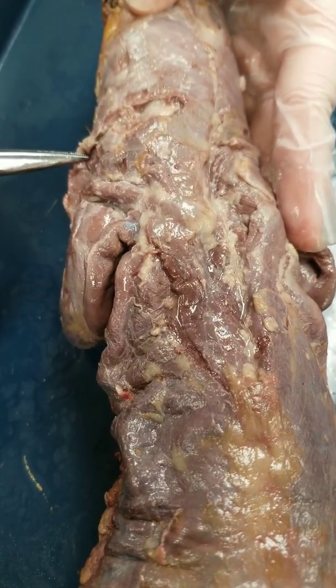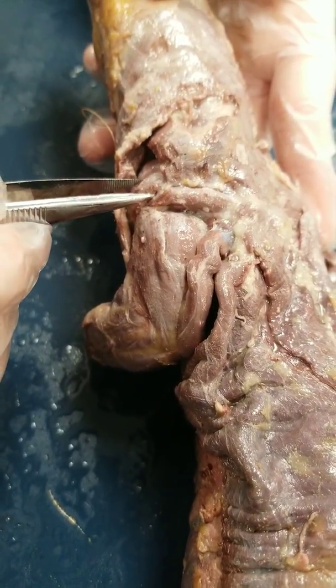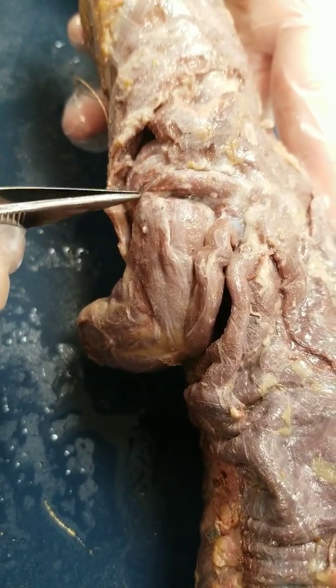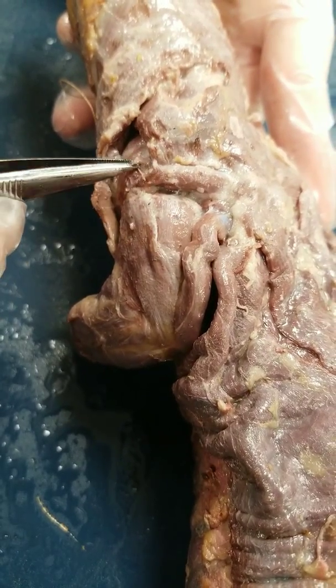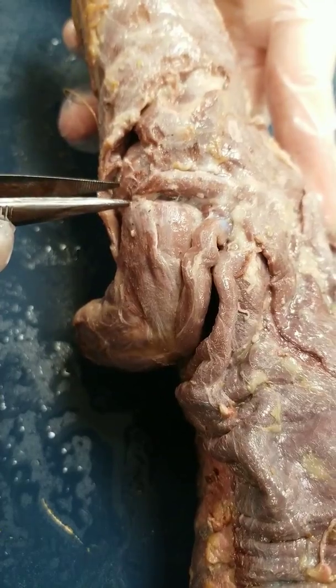The next muscle is the acromiodeltoid, which is a triangle shape near the bicep brachii. Just define the borders a little bit and clean the fat off — you can see it comes off pretty easy, but be really careful. This is the acromiodeltoid muscle.